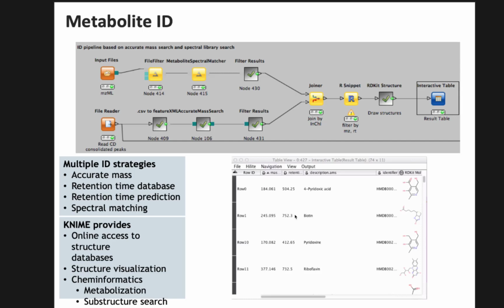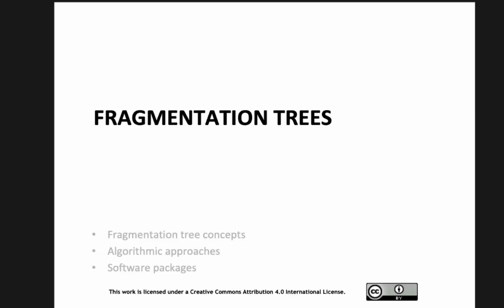There had been the idea in literature that you could also try to do something very similar to database search in proteomics. The idea is fundamentally the same. We would need a theoretical model of fragmentation, and people have tried to predict the fragmentation of metabolites for a long time, but it's not as easy as it is for peptides.